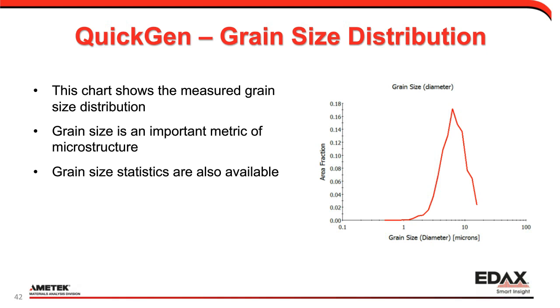But everything in the software, each of these individual components can be basically specified or customized. And so this is just an example where if I want to select a different color scale, I can come into the map properties, go to my color code pull down, and there's lists of them. And one of the things I think makes it more efficient is these are sectioned into different things. So there's some scalar measurements like image quality, fit, confidence index.